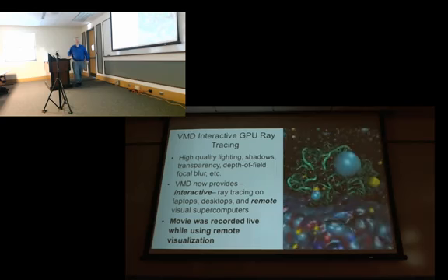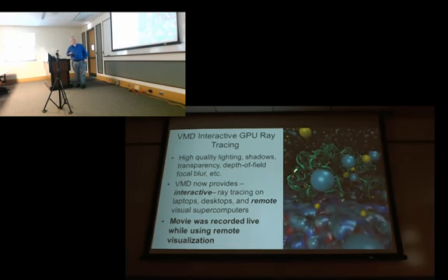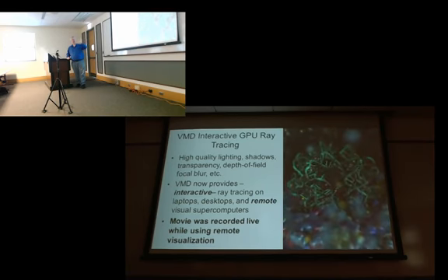To make it interactive, we have a progressive refinement approach. The renderer makes a scene very rapidly, and while you're rotating it, it's in lower fidelity, and then as soon as you release the mouse, it refines the image to a higher quality image. You can see these little speckles on the bokeh of the out-of-focus atoms that begin very speckled, and then after I release the mouse, the lighting flashes a little bit, and they start to refine, and they get fuzzy, and they become a smooth image like what you want in a final rendering.